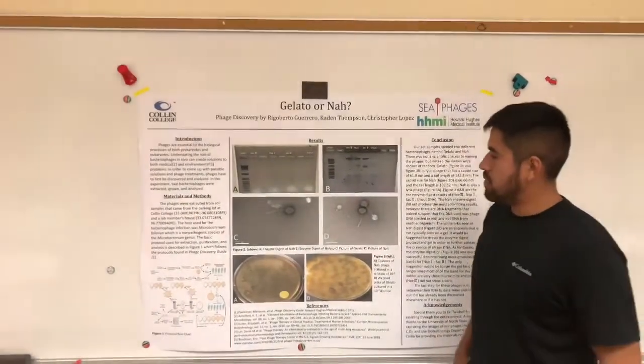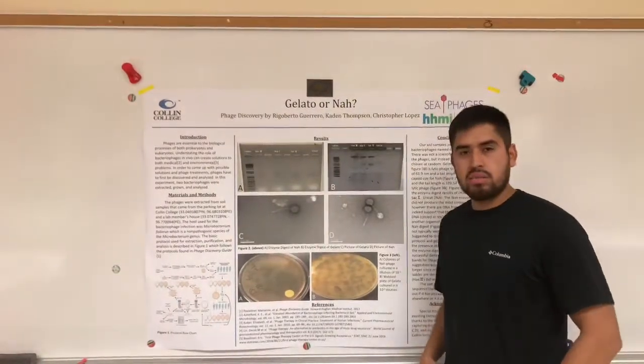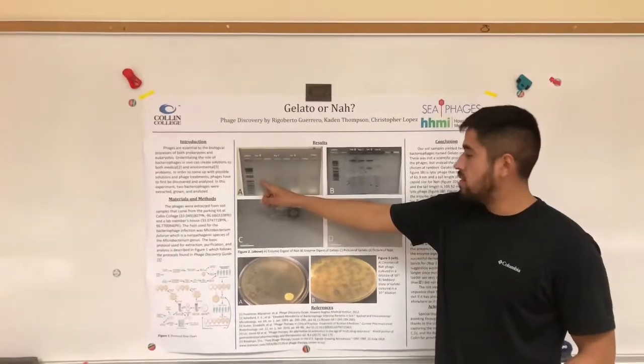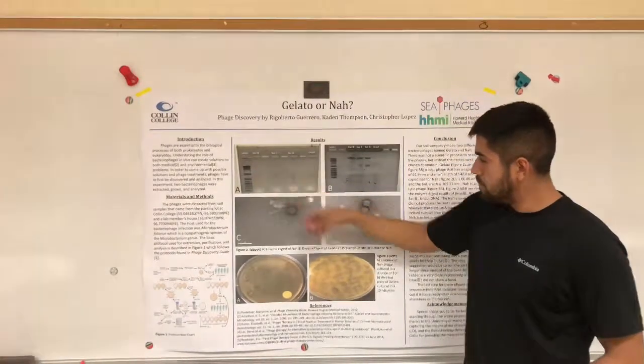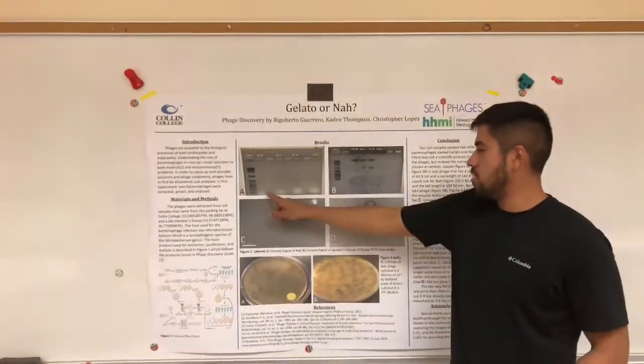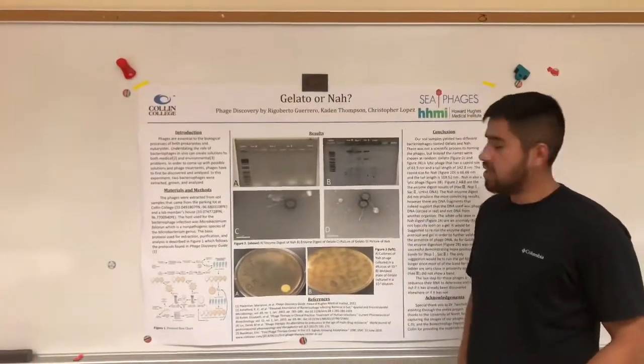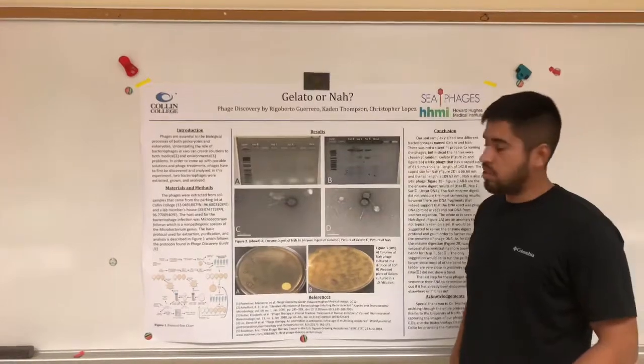With our Nah enzyme digest, we didn't have really dark bands, which is, you could say, a problem, but not really, because we did have some light bands, which are outlined in red. What you can also see are some white, opaque circles. Those are anomalies in a gel. You really don't see that.